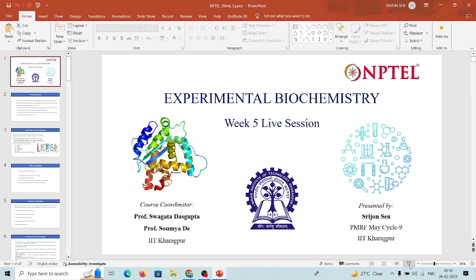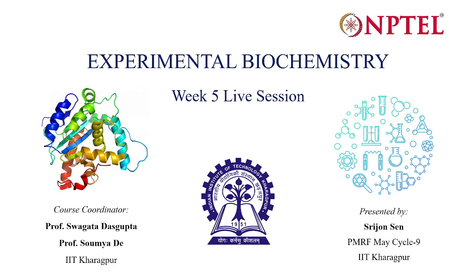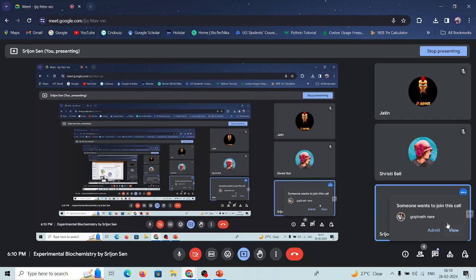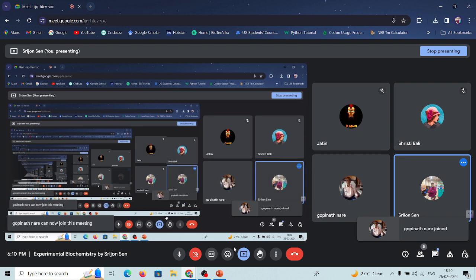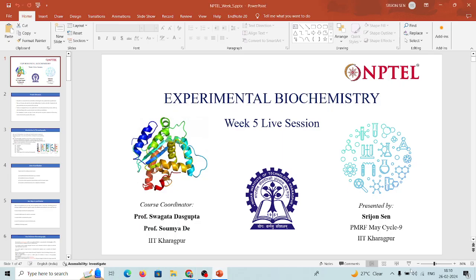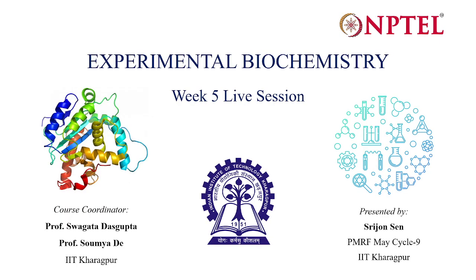In today's class, we will be mostly discussing the chromatographic techniques.